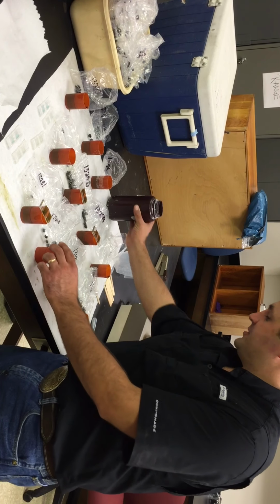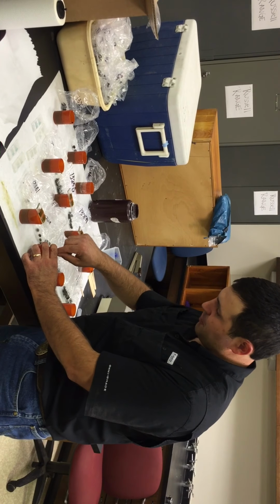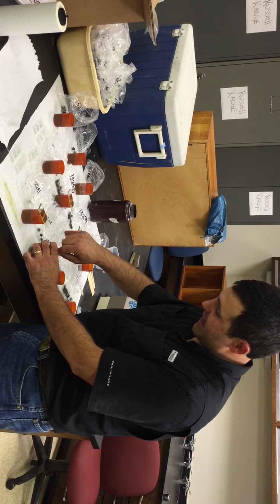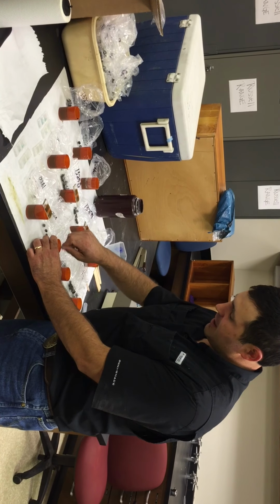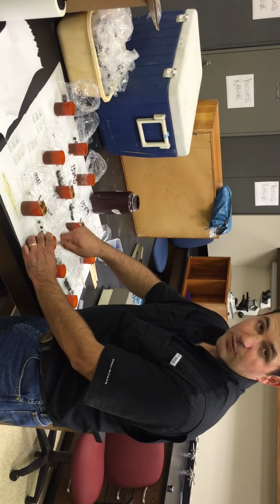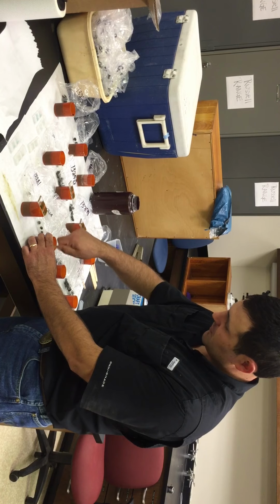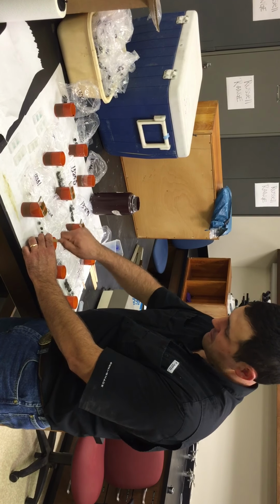And then we're going to take a popsicle stick and we're going to mash up all those pellets. The reason that we're going to mash these pellets up is the eggs are actually within the pellet and we have to free them or break them out. So we're going to turn this into a completely liquid solution, hopefully with an even concentration of eggs throughout.